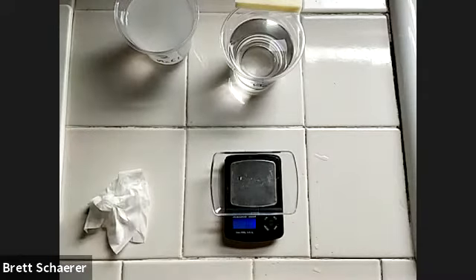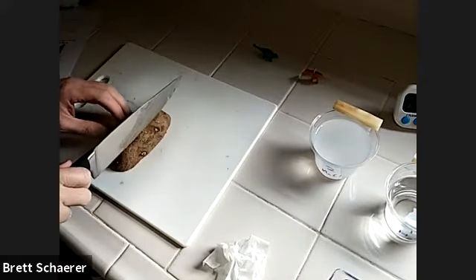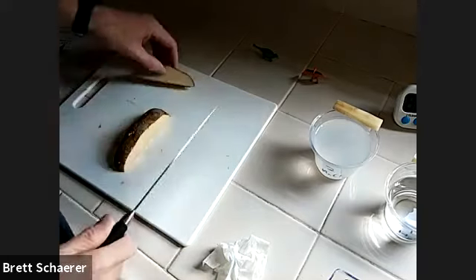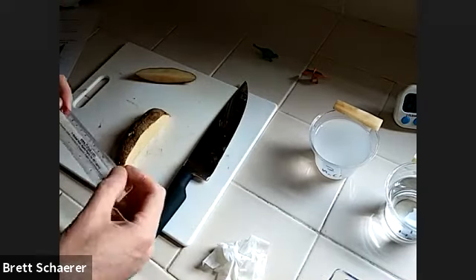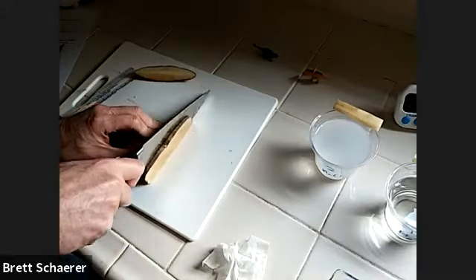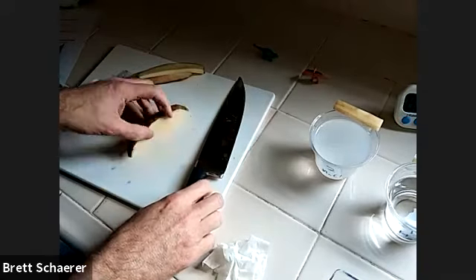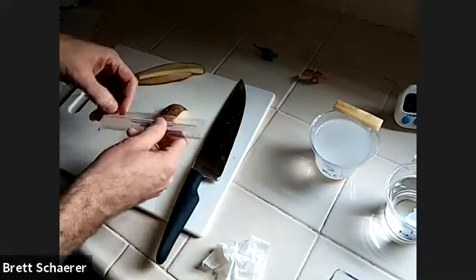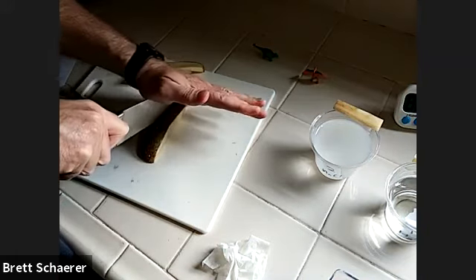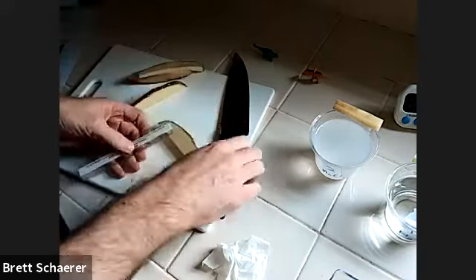And the last thing I'm going to do is cut a control piece so we can compare the saltwater and regular water pieces to what they were when they started. So next I'm gonna get a fresh slice this way.